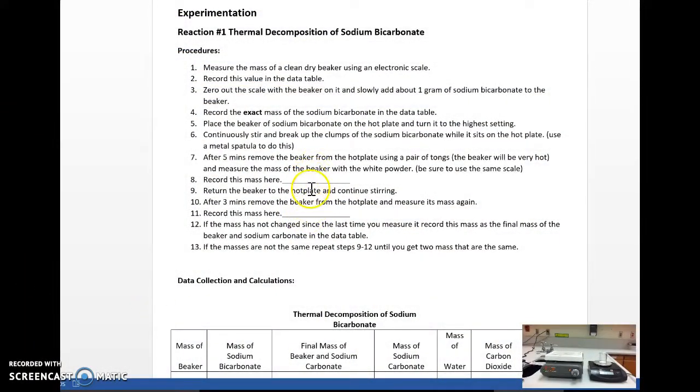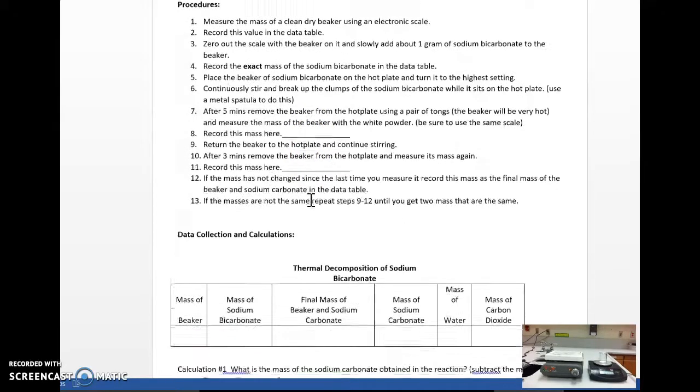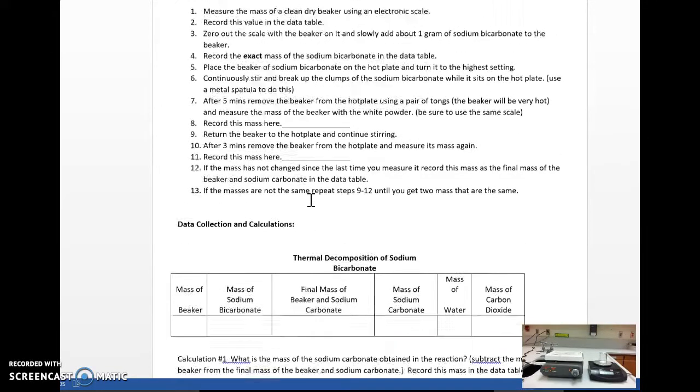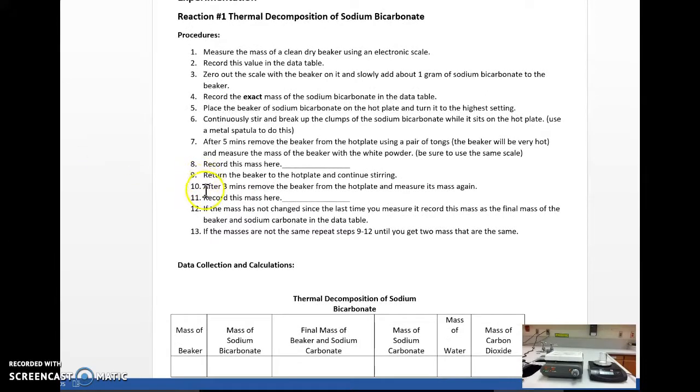If these two values are the same, I'm done. I can go ahead and record that as the final mass of the beaker and sodium bicarbonate. If not, I will repeat these steps 9 through 12, which we just did.